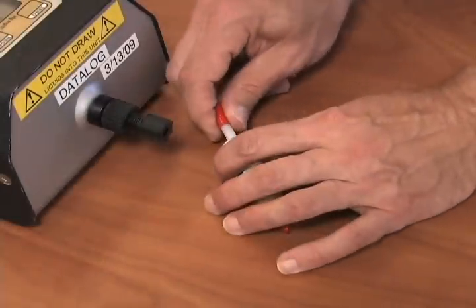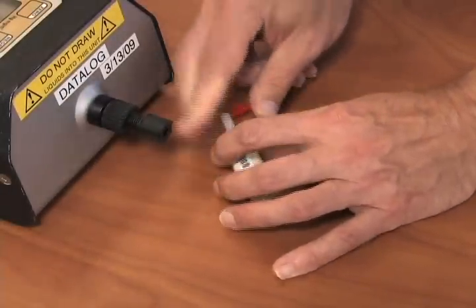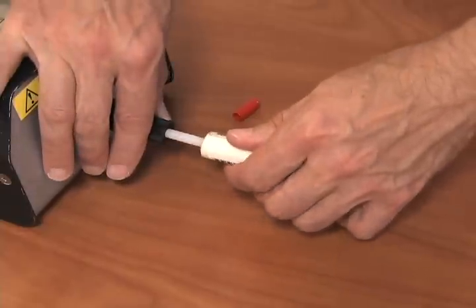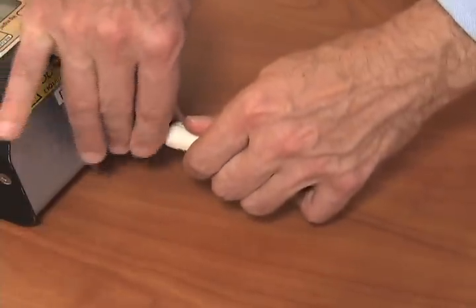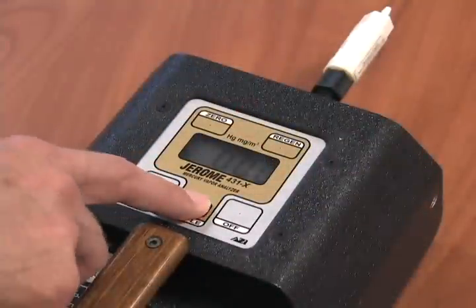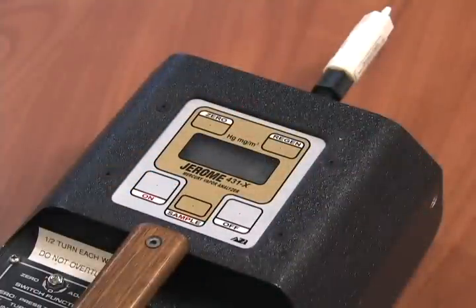You should also re-zero the unit prior to starting your survey. To do this, connect the zero filter and turn on the unit. Press sample. The digital readout should drop to near 0.00.